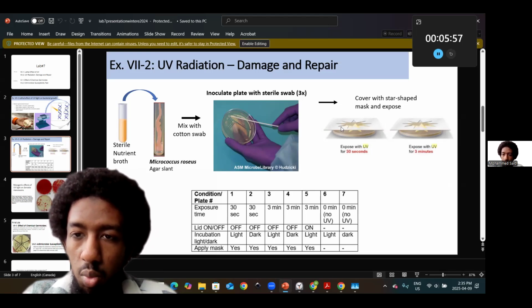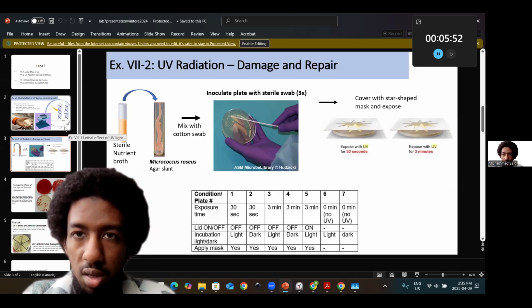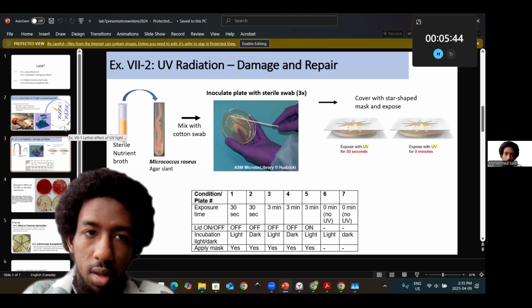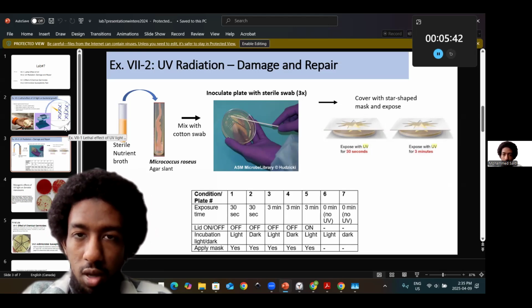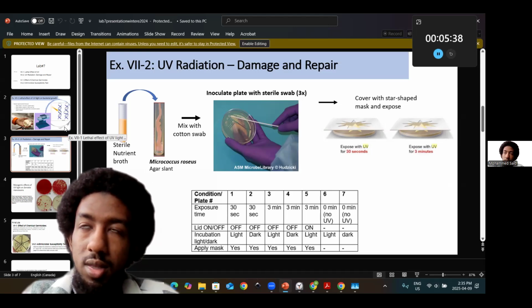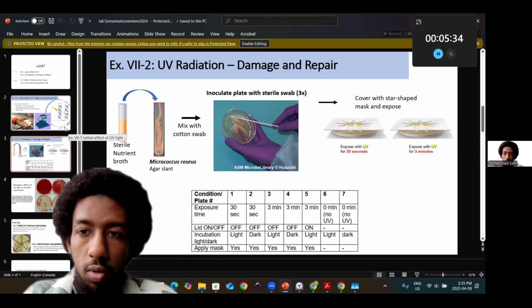And the idea is that that would have controlled, and actually, even though for exercise one it wasn't highlighted, you had, as you recall from your FLR, a half side mask, which was side B, for example, and then an unmasked side, exposed for bacterial exposure to UV.